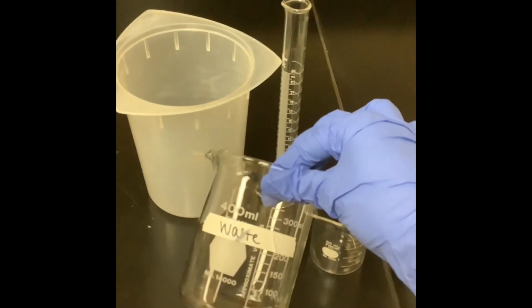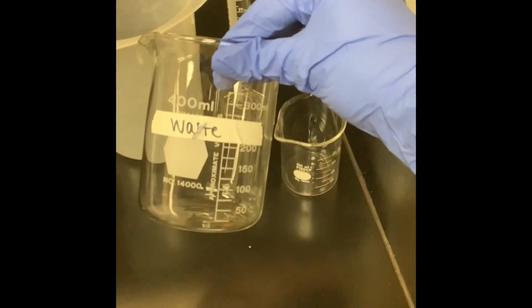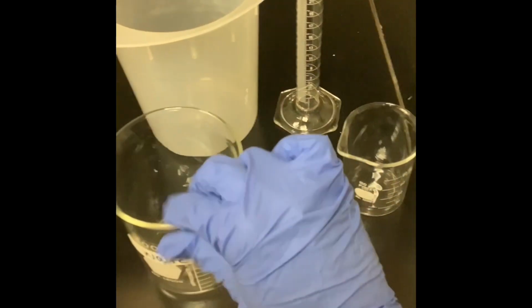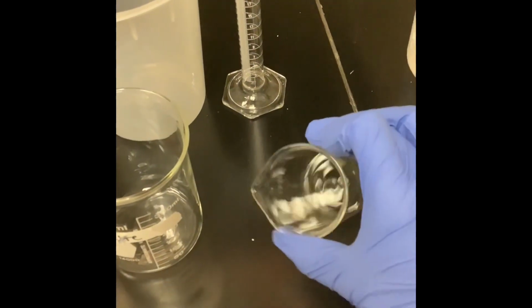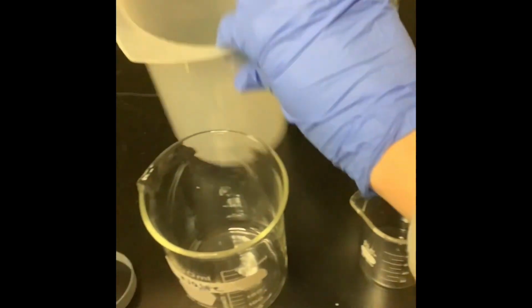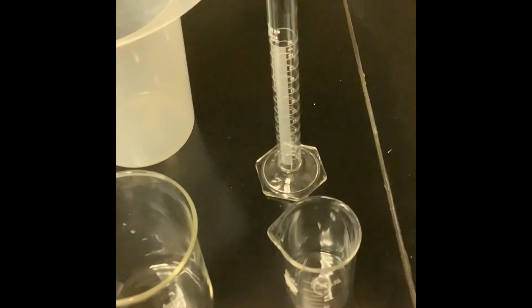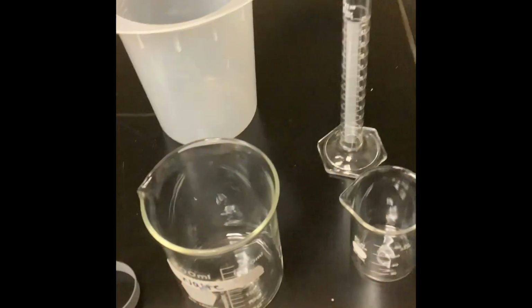So we have a waste beaker. Any sort of chemical waste that you produce during the process, you're going to put in here, and we'll dispose of this properly at the end. I always like to put my glacial acetic acid in a smaller beaker so it's easier to work with. Graduated cylinder for measuring volumes. I use this little plastic thing to eject my pipette tips, and then a 1000 microliter pipette.